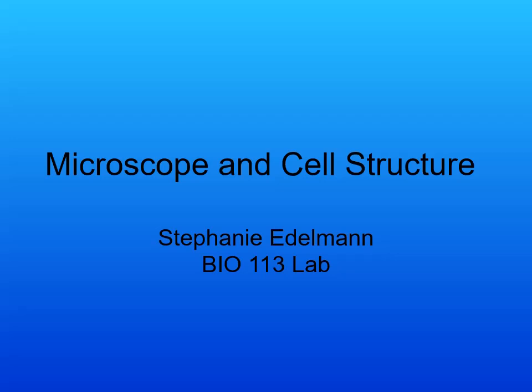We're going to be talking about microscopy and cell structure this week. I'm going to separate this week's lecture into two distinct sections, the lecture part and the lab instruction slash demonstration part. I'm going to talk about the more theoretical aspects and the background you need in the lecture, and then walk you through as much of a hands-on lab as I can walk you through without an actual microscope in front of you for the demonstration part.